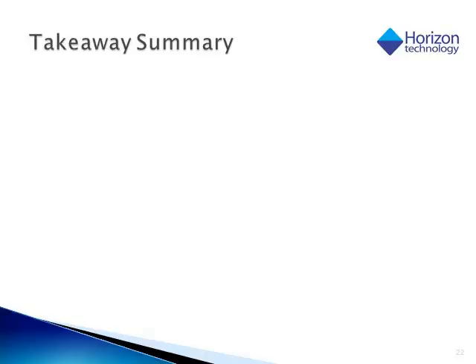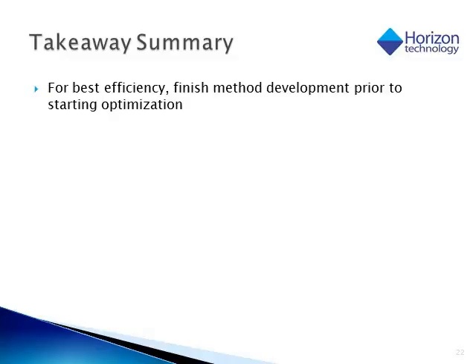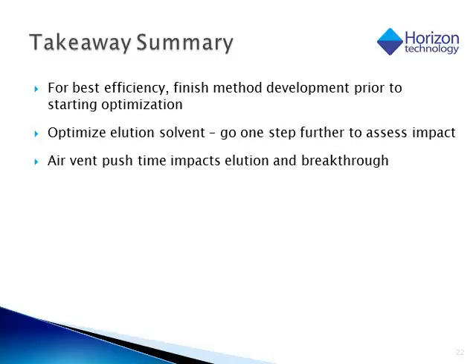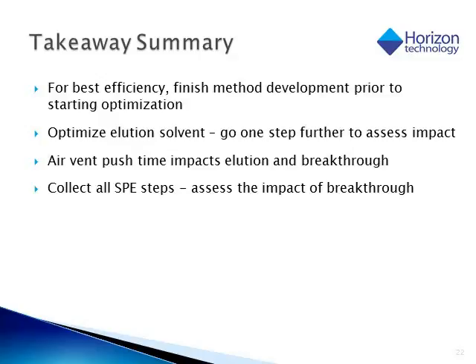So let's look at the summary of the takeaways from this particular method development situation. For best efficiency, probably finish method development prior to starting optimization. When looking at the elution solvent and optimizing it, it might be good practice to go one step further to assess the impact and make sure you have the optimal solvent. Keep in mind that the air vent push time does impact elution and breakthrough. Best practice to determine and assess the impact of any breakthrough: collect all of the SPE steps: load, wash, and elute.